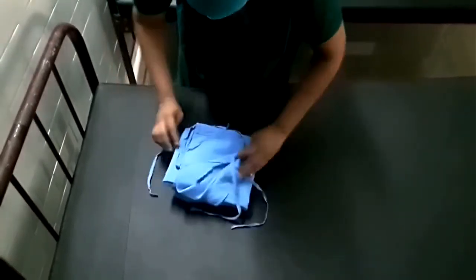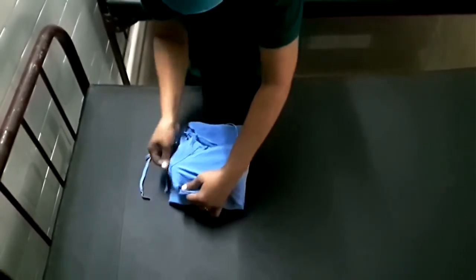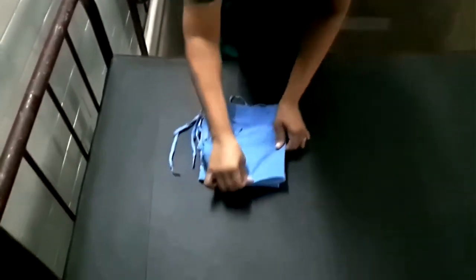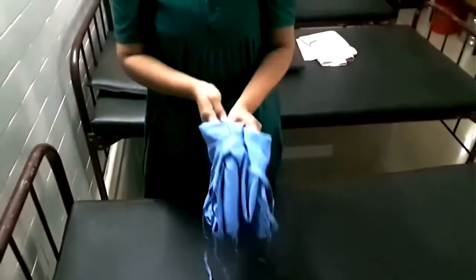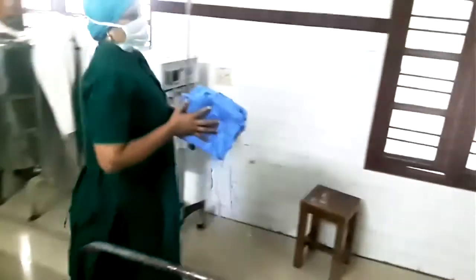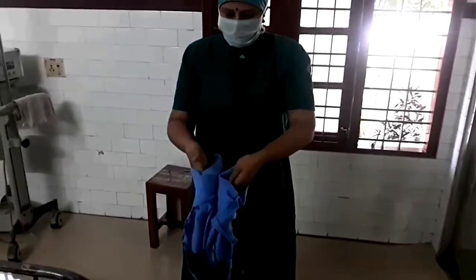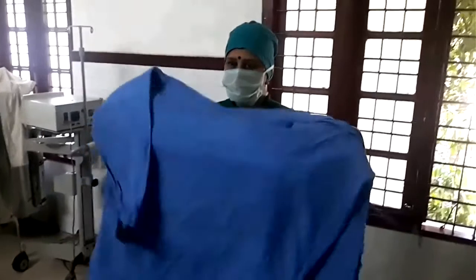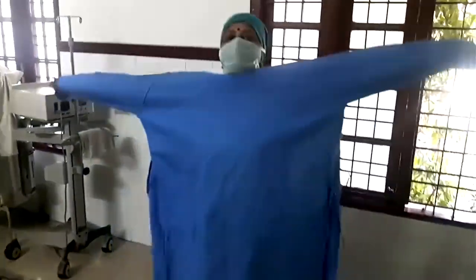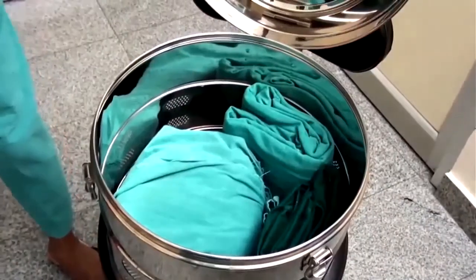What she's doing is she's extending the fold she did at the back. Just now you can put a tie if you want or leave it like this. Once you remove it from the bin, you can introduce your hand into the pouch-like thing which appears there and just open it. It opens up like that. You're not going to touch any part of the gown.